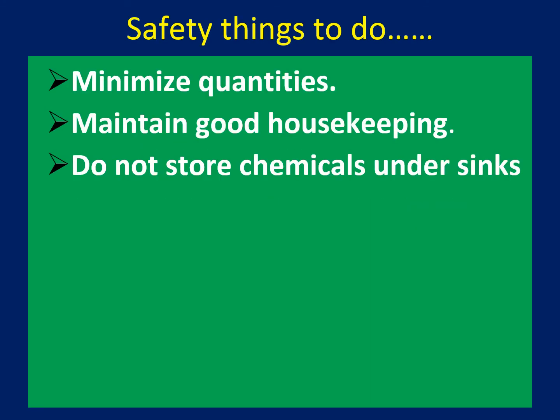There are main safety things to do. Minimize the quantities. Whenever you are running chemical reactions, minimize the quantities in the first place if you are doing some experiment, and maintain good housekeeping. I have already provided you some guidance on housekeeping, and don't stock chemicals under the sink.